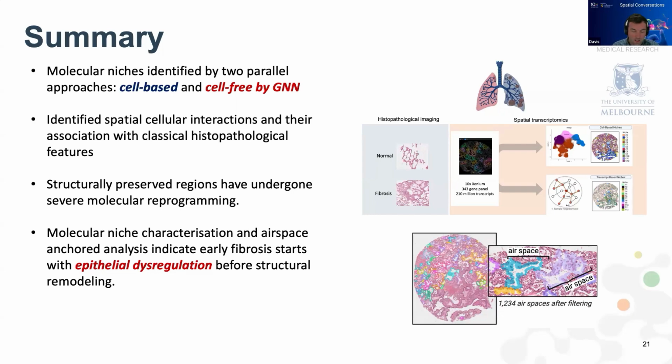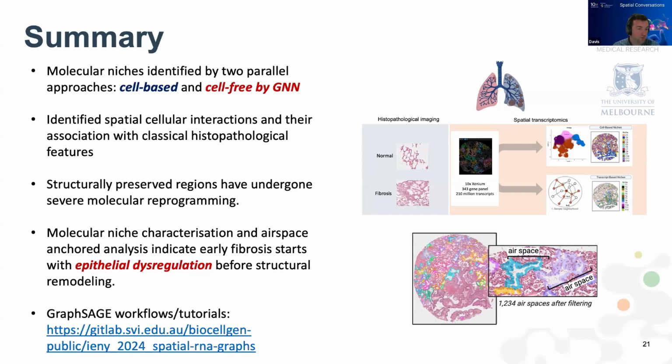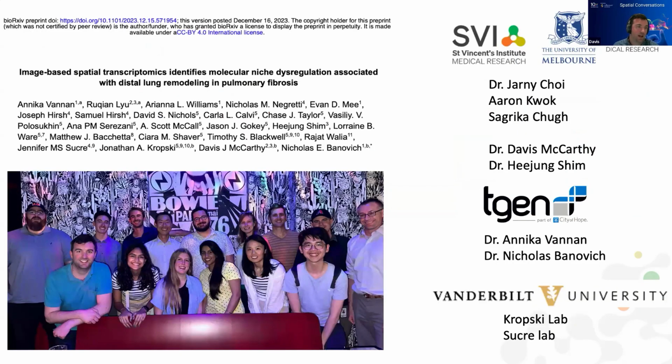And Ruchen's been working hard recently on actually making the GraphSage approach that we used here easily applicable by others. So she's put together workflows and tutorials that are available at that link, and we can share that again for anyone who wants to follow up and do those things themselves. So that's the paper and the team, and I'll stop talking and hopefully let you ask lots of questions. Thank you.